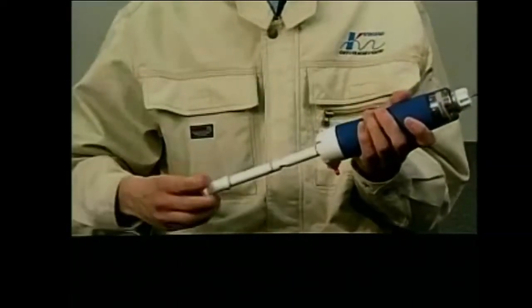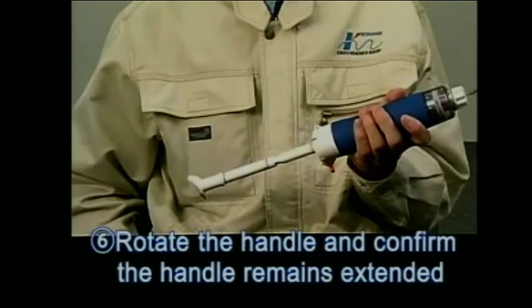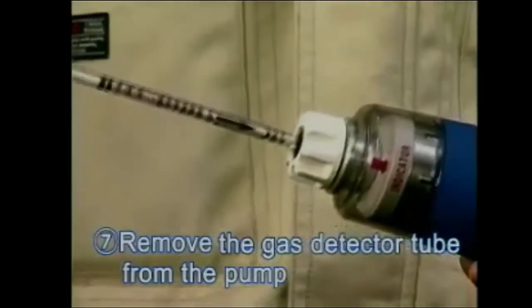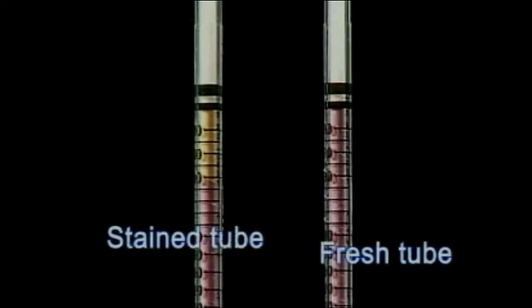After the sampling is completed, turn the handle 90 degrees clockwise or counterclockwise to unlock the handle. Confirm that the handle remains fully extended. Remove the detector tube from the pump. Read the maximum end of the stain against the printed scale on the detector tube. For tube 126SF, the colour changes from pink to yellow.